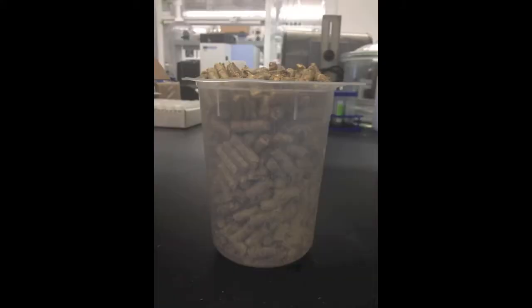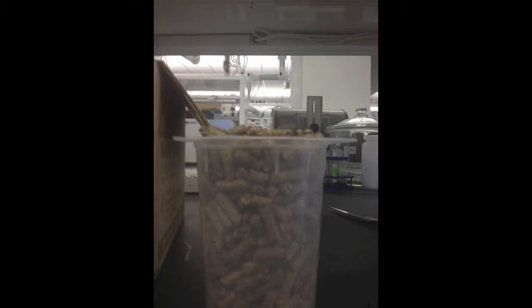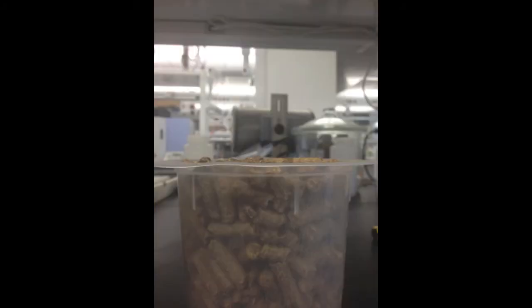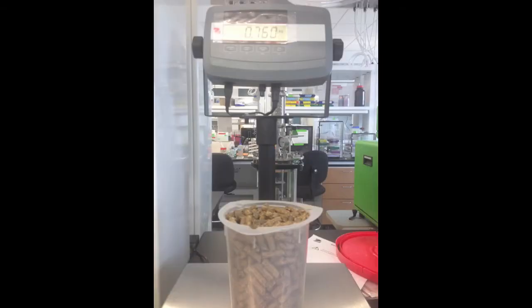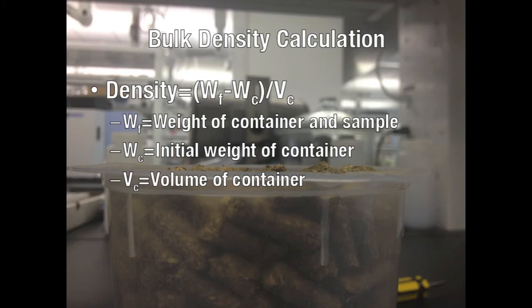Next, dry the container and fill it to capacity with a densified biomass. Drop the container onto a hard surface from a height of two to three inches several times to allow the material to settle. Then add additional sample to the container and use a straight edge to strike off excess. The material should be level with the top edge of the container. Weigh the container and material. To calculate bulk density, use the equation: weight of the container and sample minus weight of container, divided by the volume of the container.